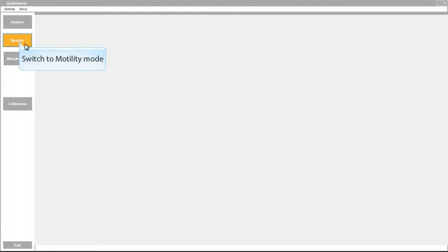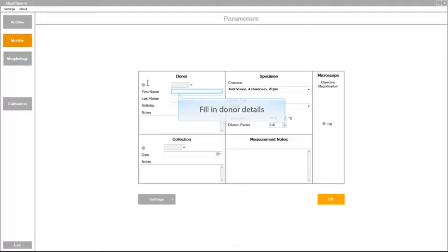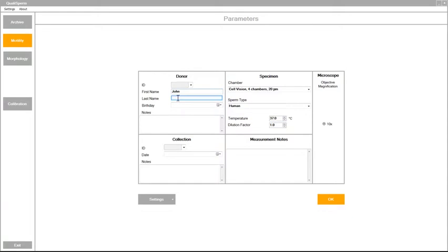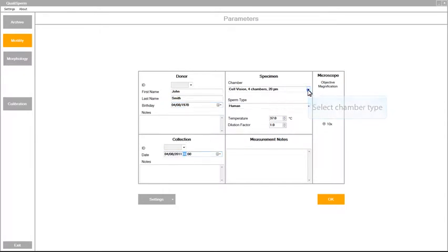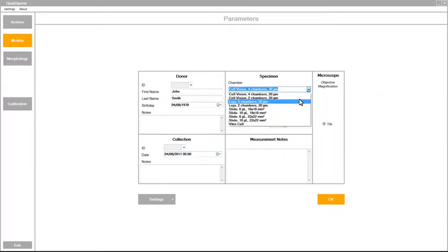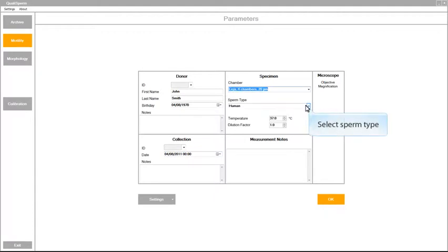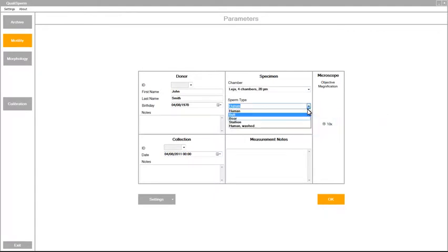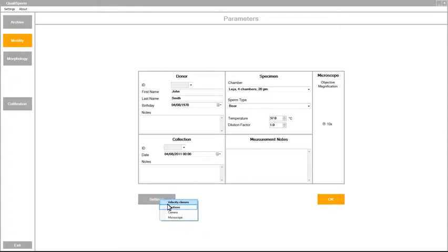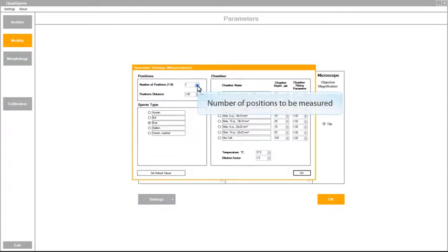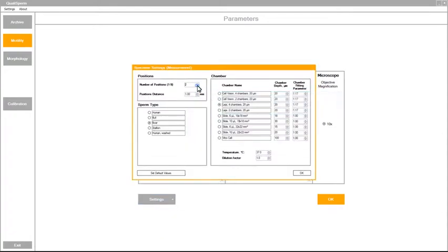Put your sample under the microscope. Activate the motility module which starts the measurement of concentration and motility. Fill in your donor details, your chamber type, your sperm type and the number of positions you want to measure which can be up to 9 in the Qualisperm system.